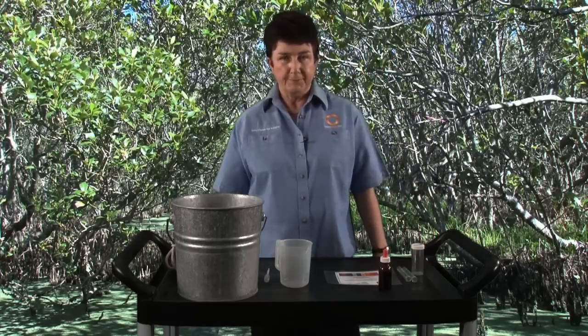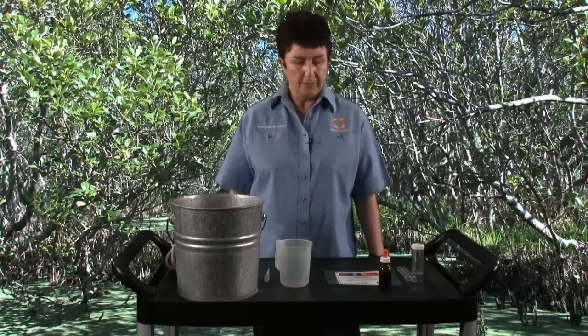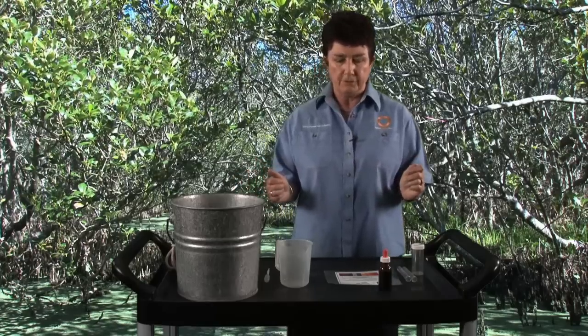Hi, I'm Dr. Marianne from Sydney Olympic Park and this is a how-to video on performing a water pH test. The reason we might do that is to check the status of a water body to see if the pH is within a healthy range.